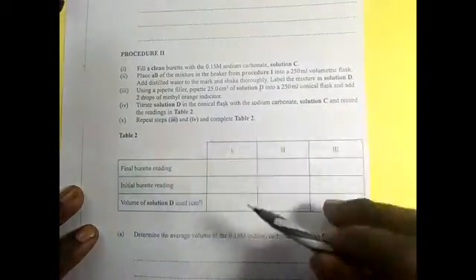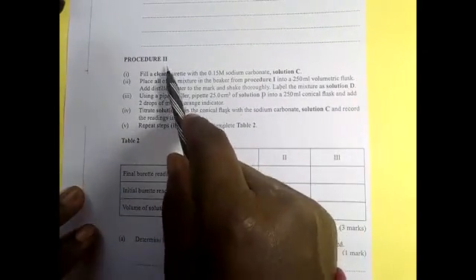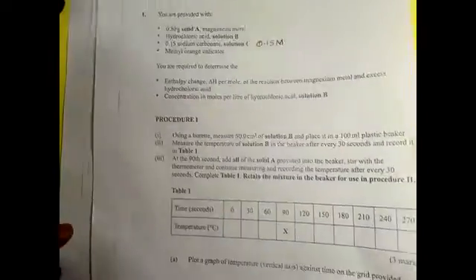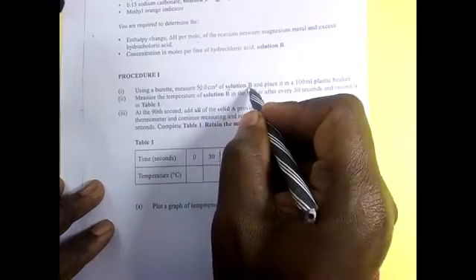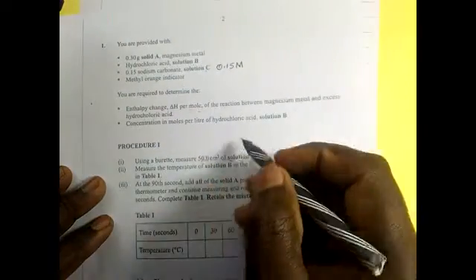Because we have not done procedure 2, I want to remind you that in procedure 1, 50 cm³ of solution B was used, and solution B is hydrochloric acid, but this hydrochloric acid was in excess.